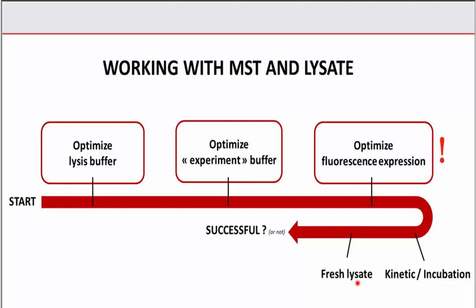We were performing the extraction in the morning, for example, and we performed MST right away after the extraction. So I hope that with all those little tips, you might be successful with working with cell lysate and MST.